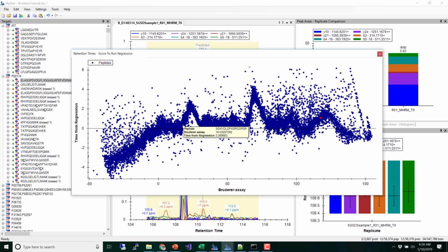We only gave it 5 minutes, so even the decoys are going to fall within this 5-minute range, right? And our targets are all over this 5-minute range. So this is not going to be that strong a score, even though there's a really nice trend here. I guess if we use Brian Searle's KDE, where he was talking about running across a ridge, you might have a much stronger retention time score.